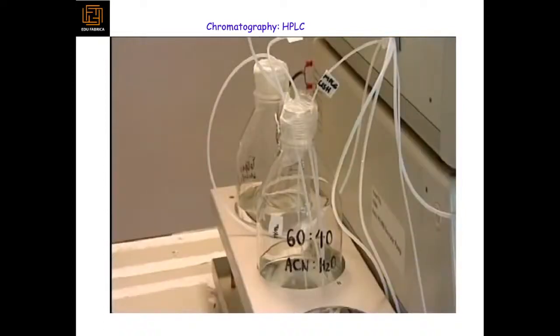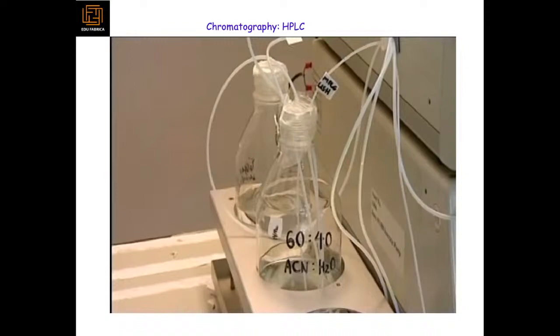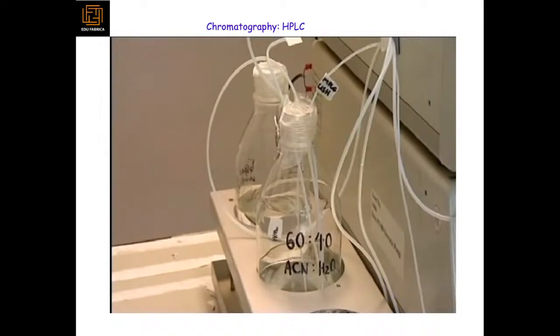Two solvents can be mixed in any proportions to give a mixture, the liquid phase, of suitable polarity for the separation that is being done. In this case, one solvent is water, very polar, and the other ethane nitrile, less polar. The operator can decide on a mixture with the correct polarity for the separation she is doing.